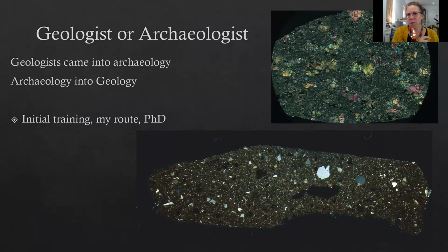And during my PhD, I used my PhD as an opportunity to learn petrography. And as I said, I went to the geology department and looked at how you identify rocks. But I think my grounding as a field archaeologist and a pottery specialist gave me a different way of looking at the thin sections and seeing the people in the pots. What were they doing? What was this potter trying to do? What did they do when they were making the pot? Where were they going to get the clay? And that can add to the picture.